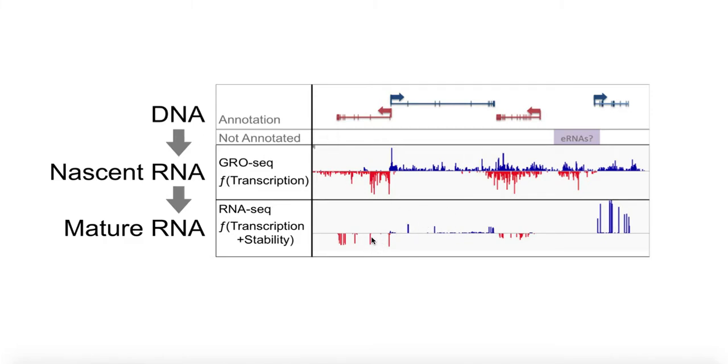So you see these kind of sharp peaks, and if we trace our mouse cursor up, these are over exons. So these little dashes, these little lines that are over the gene are the exons. So you can see there's a lot more intron to exon, but you get these peaks, and it can give you information on which isoform is being expressed. Okay. So a little bit different, and you can start to visualize the differences between these two types of analyses.